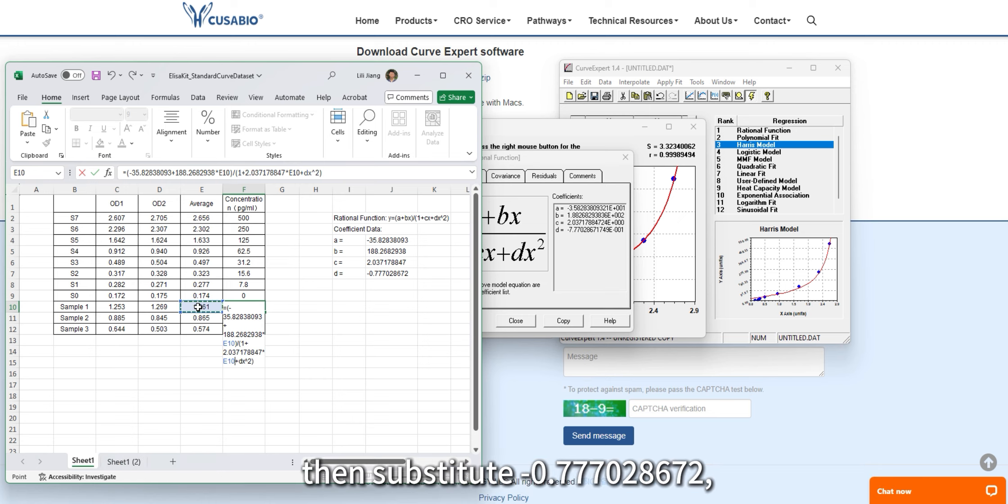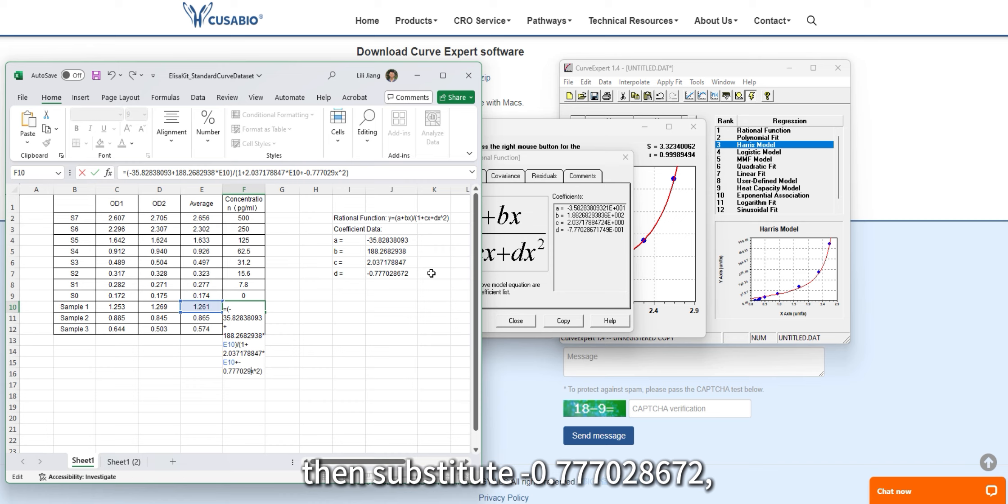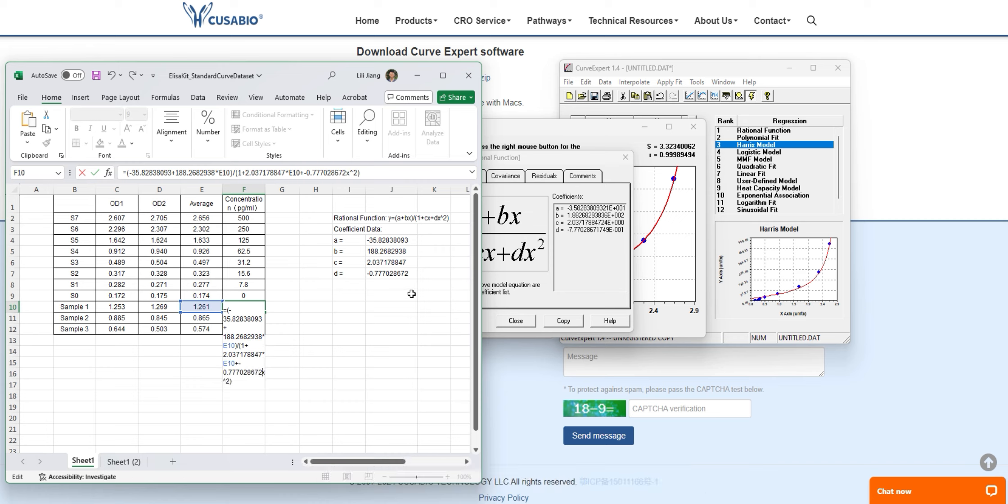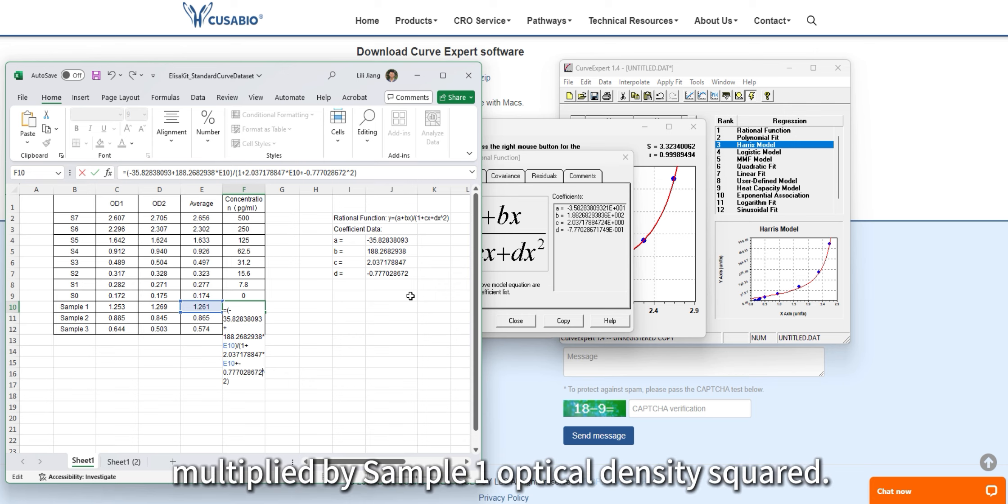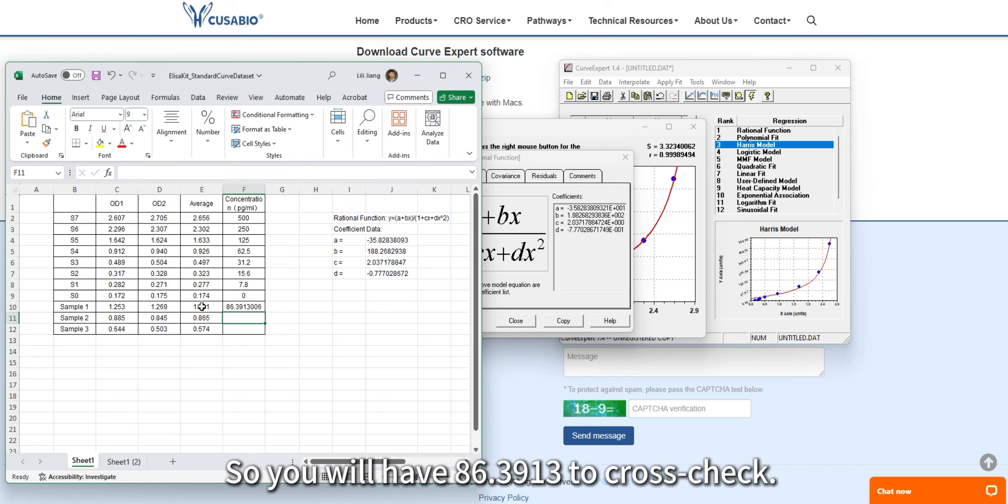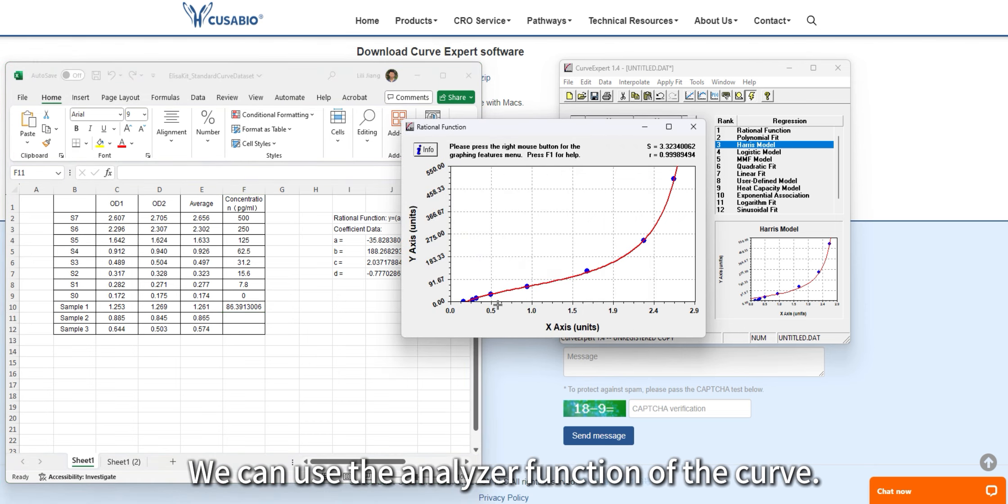Then substitute D: minus 7.786672 multiplied by sample 1 optical density squared. So you'll have 86.3913 to cross-check.